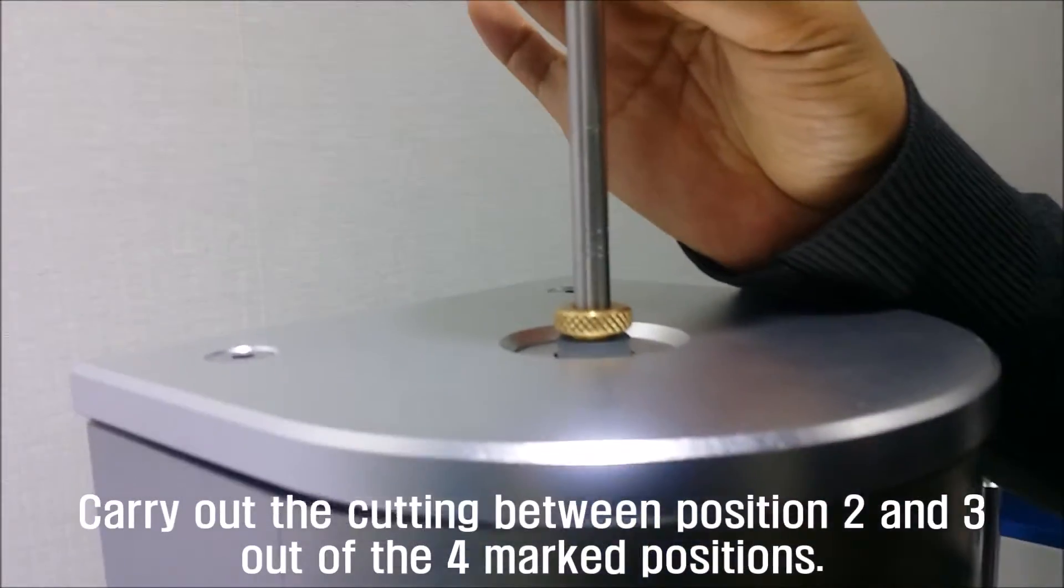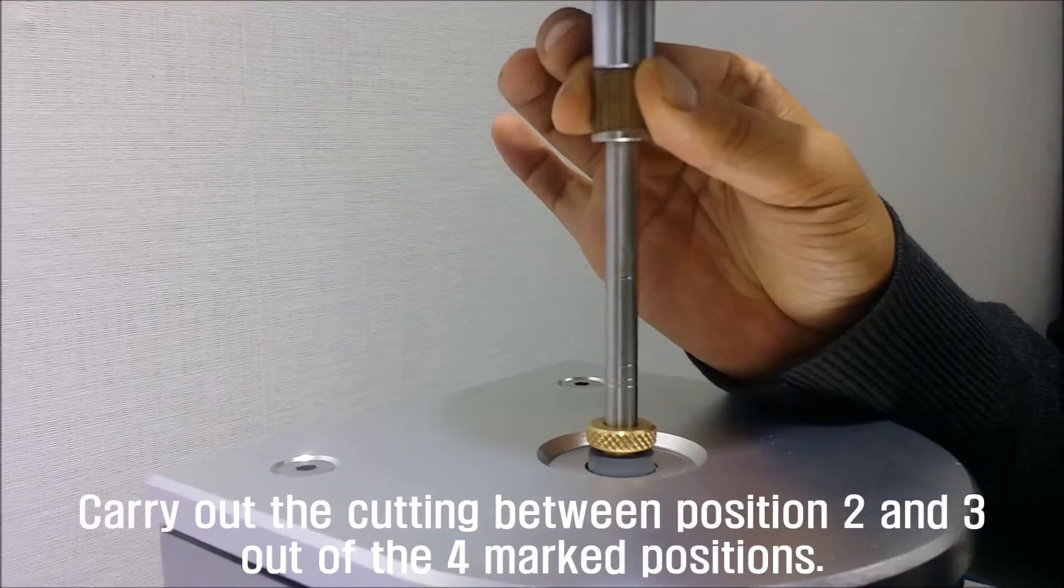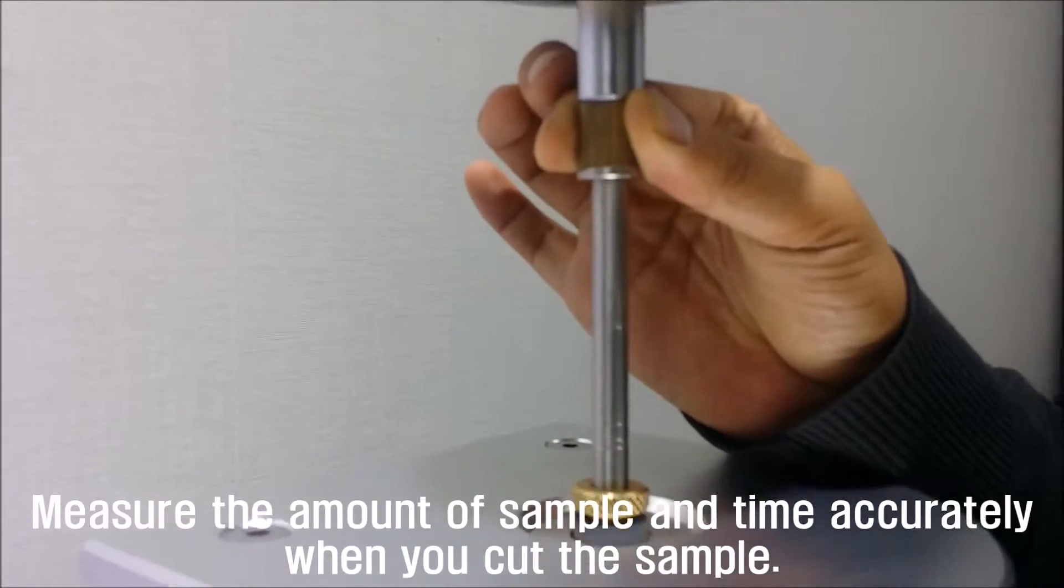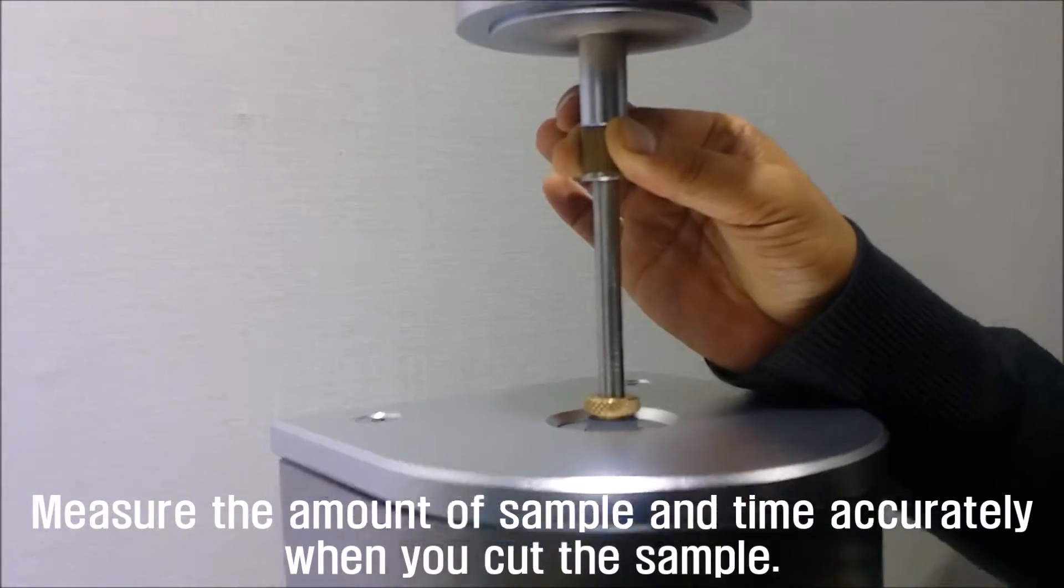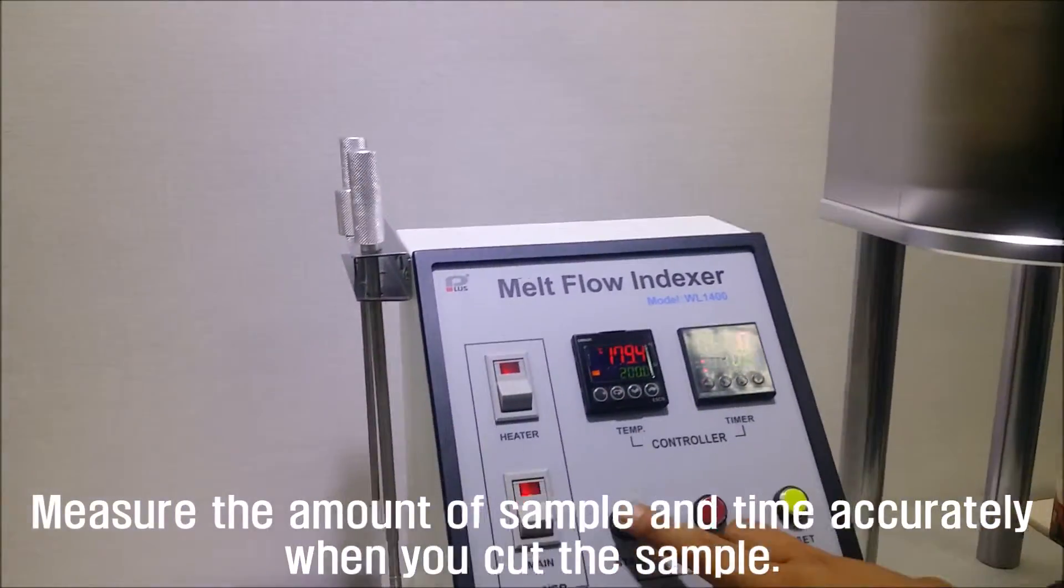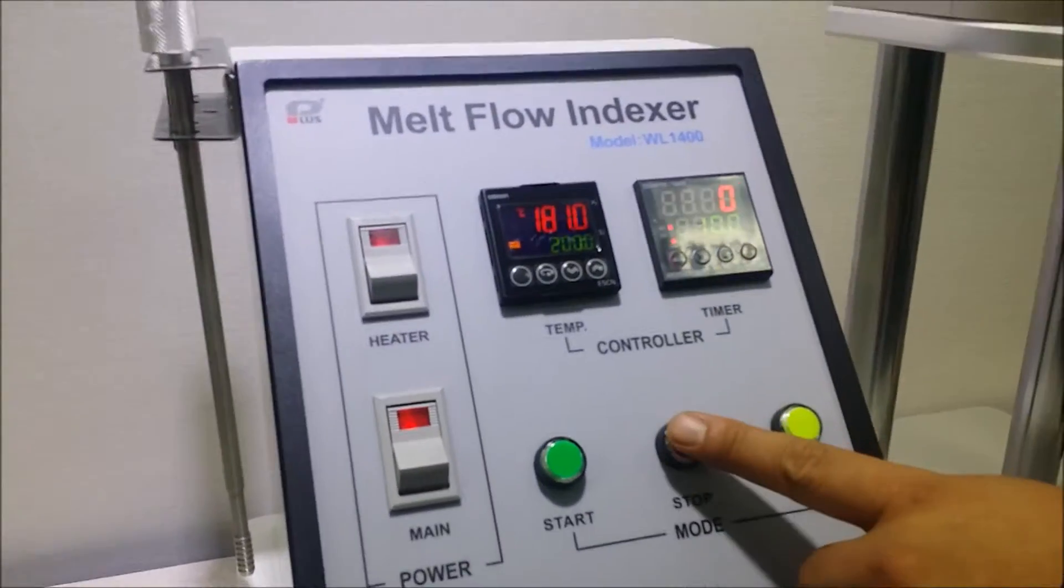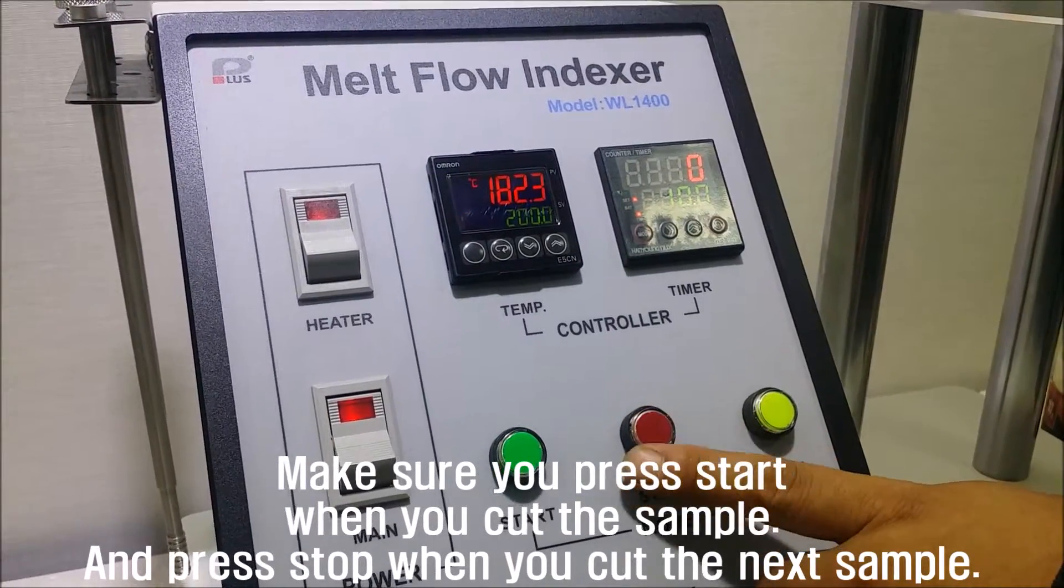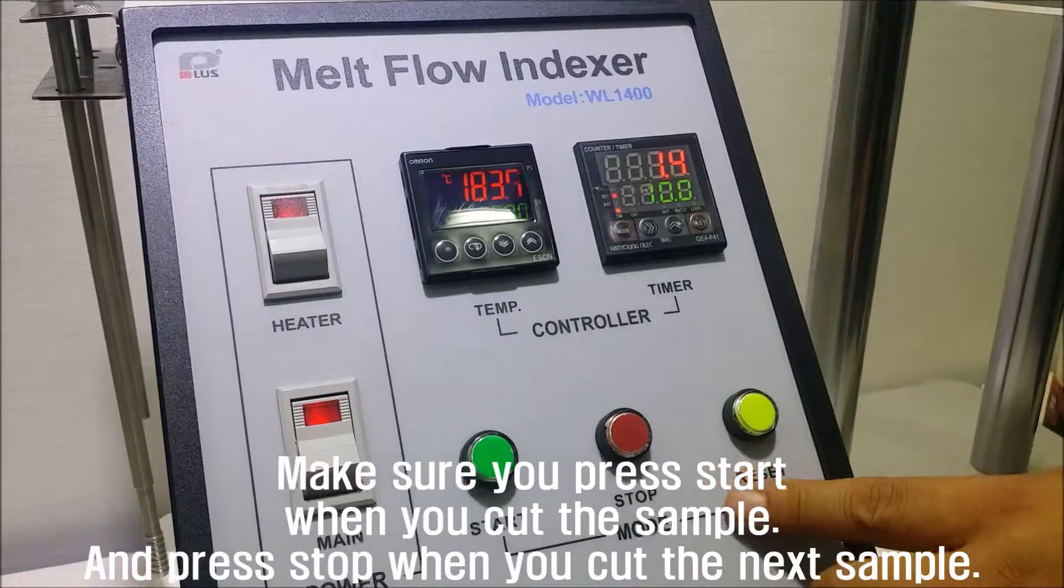Carry out the cutting between position 2 and 3 out of the 4 marked positions. Measure the amount of the sample and time accurately when you cut the sample. Make sure you press start when you cut the sample and press stop when you cut the next sample.